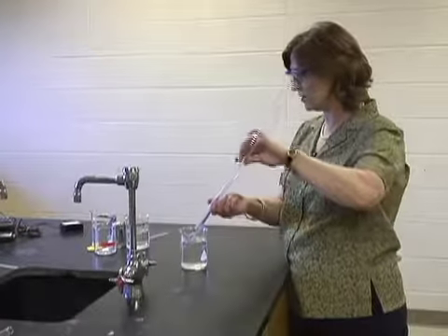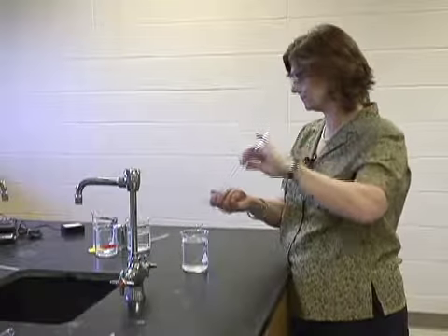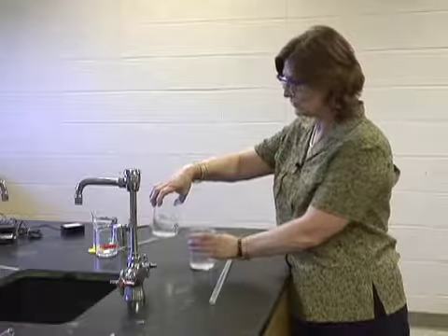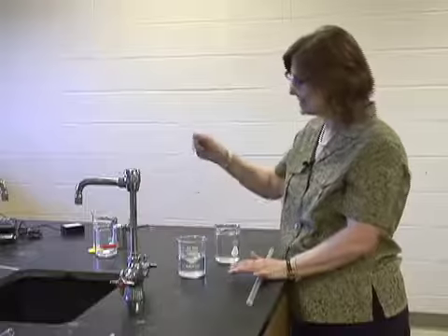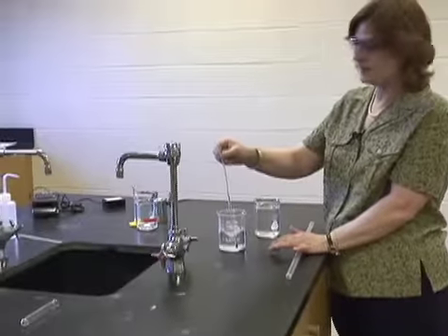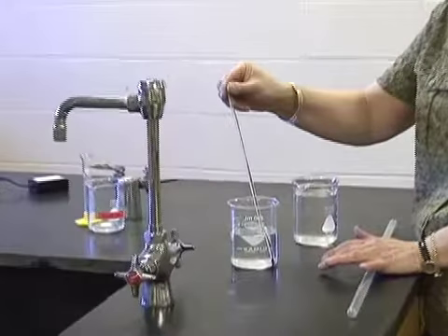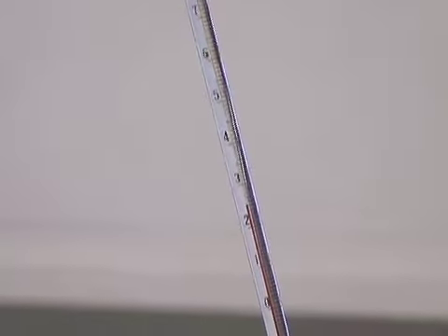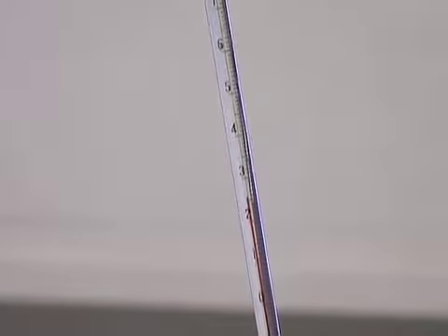And then I'm ready. I'm going to pour all this water out. I am going to take the temperature of my water that I'm going to use to collect this over water. Give it a second to get to the temperature. And it seems to be 26.0 degrees Celsius.